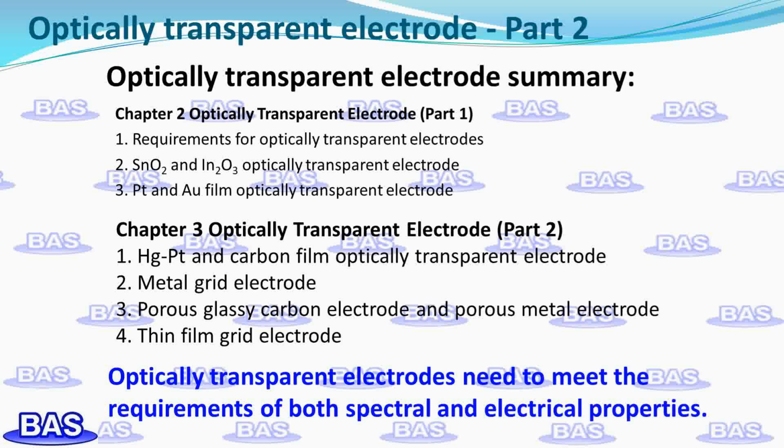2. Metal grid electrode. 3. Porous glassy carbon electrode and porous metal electrode. 4. Thin film grid electrode.